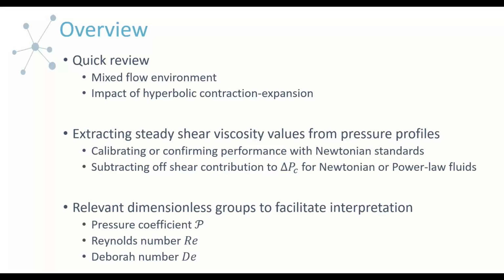And one use of this data would be if you are able to correct for this steady shear contribution and subtract it off from the pressure drop across the contraction expansion region. So checking performance, this can help you with that. And then also if you are able to correct for a Newtonian or power law fluid. And so we'll talk about this in detail.